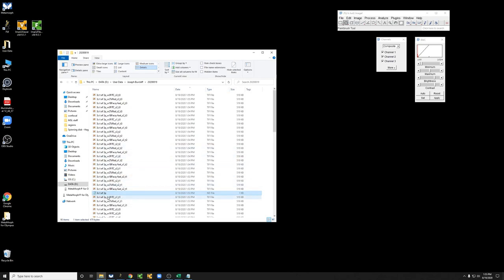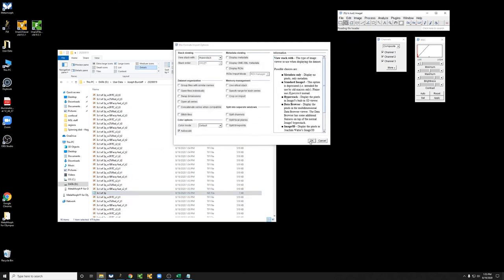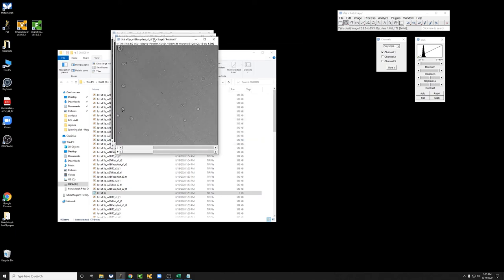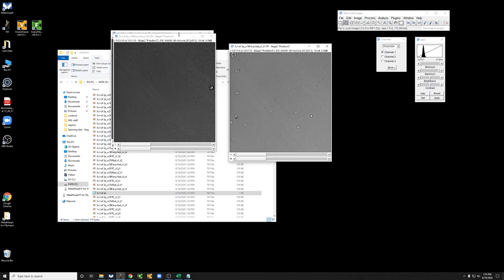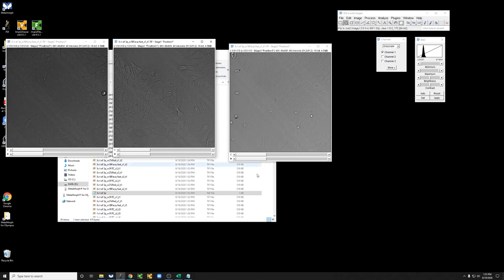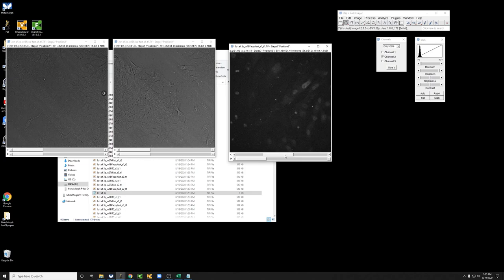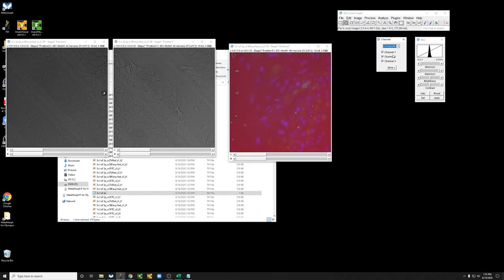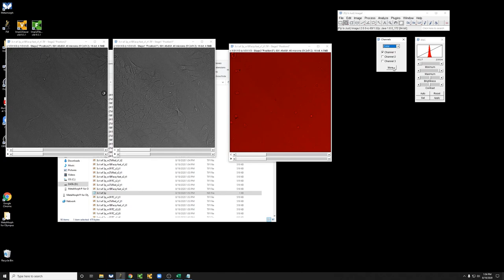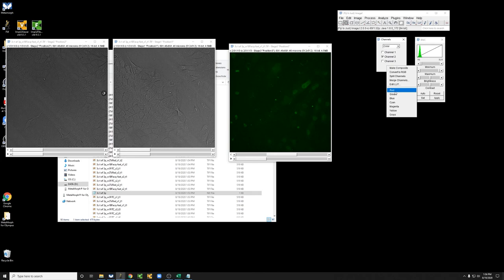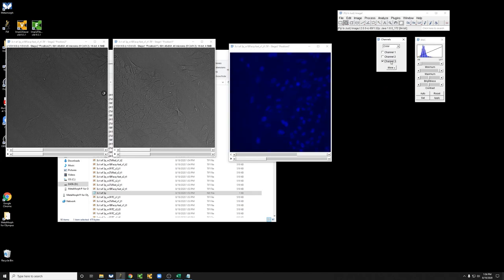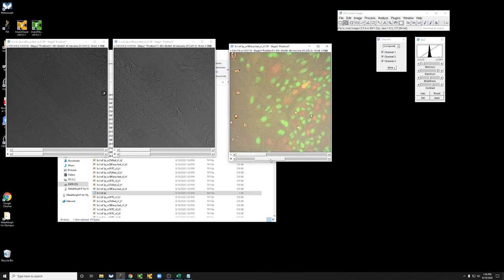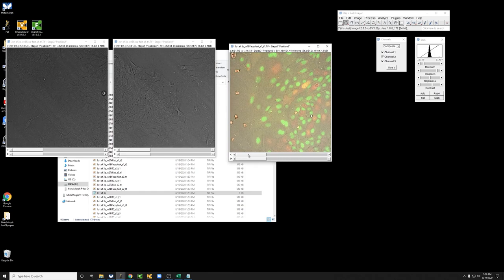Here's the data for this experiment. If I drag the corresponding ND file into Fiji and open all of them, what you can see is that now I have the three positions, each of which has three time points, and each of which has three channels, bright field, red, and green, which I can see more clearly. If I do composite and then change the color so that the first one is gray, the second one is red, and the third one is green. So you can see a three channel time lapse.